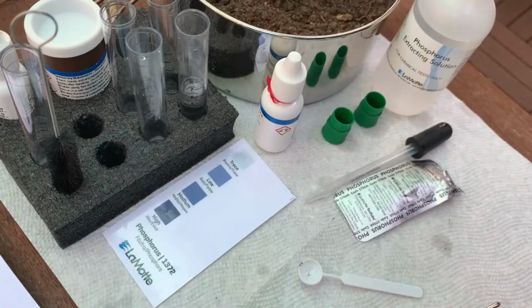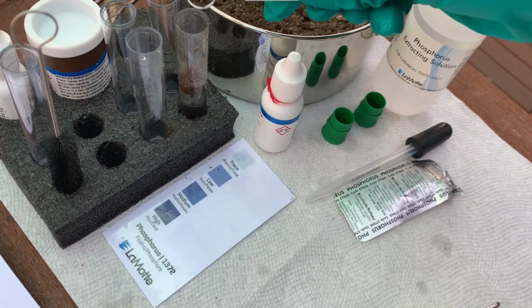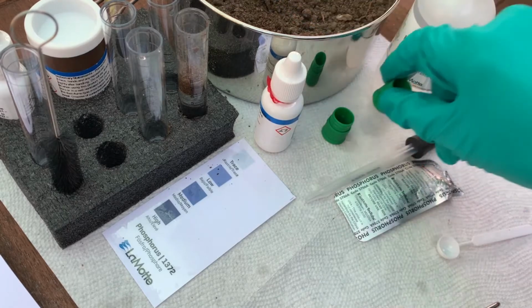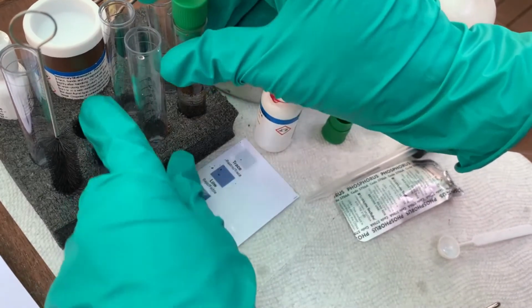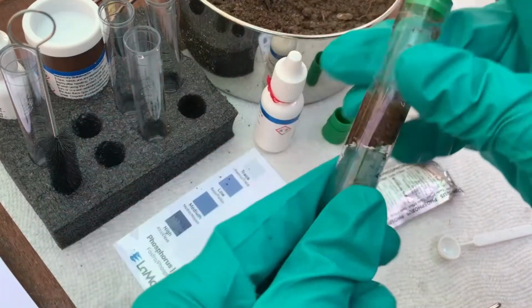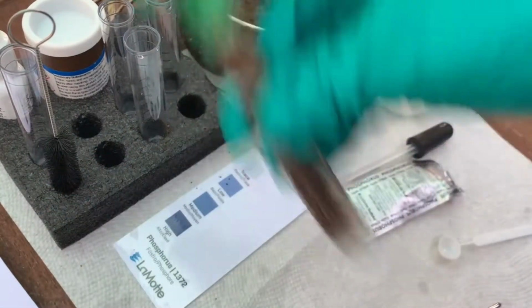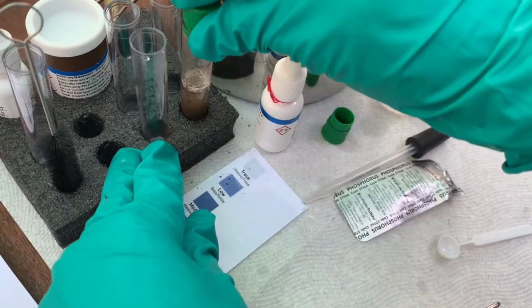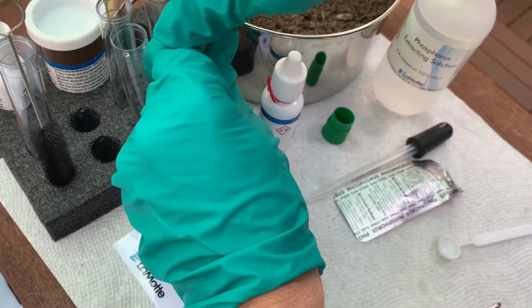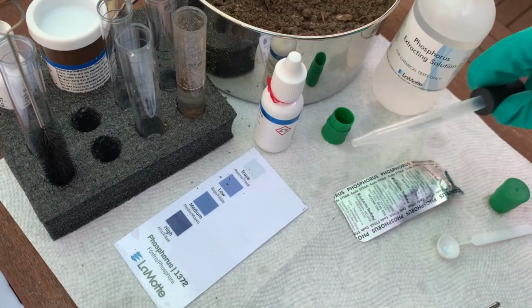Here we fill the test tube to line 6 with phosphorus extracting solution. And this time we're gonna use the 0.5G spoon in order to add 3 measures of soil sample. You wanna cap this and gently mix for 1 minute. And you want to remove the cap and allow the liquid to develop above the soil. So wait till the soil settles.